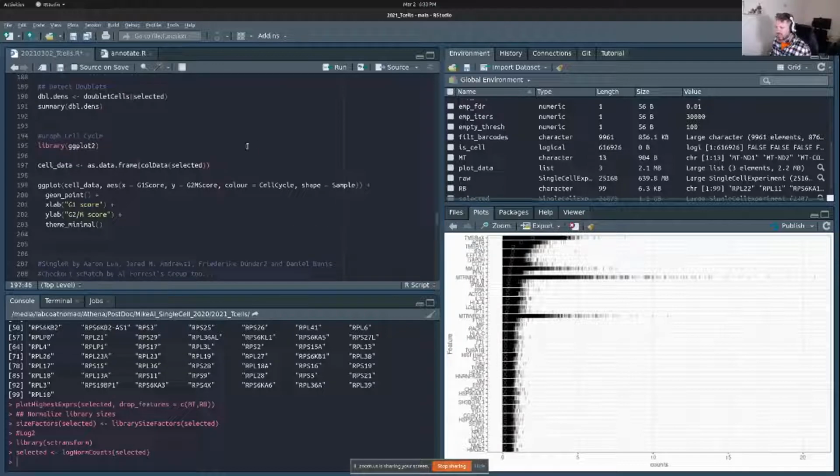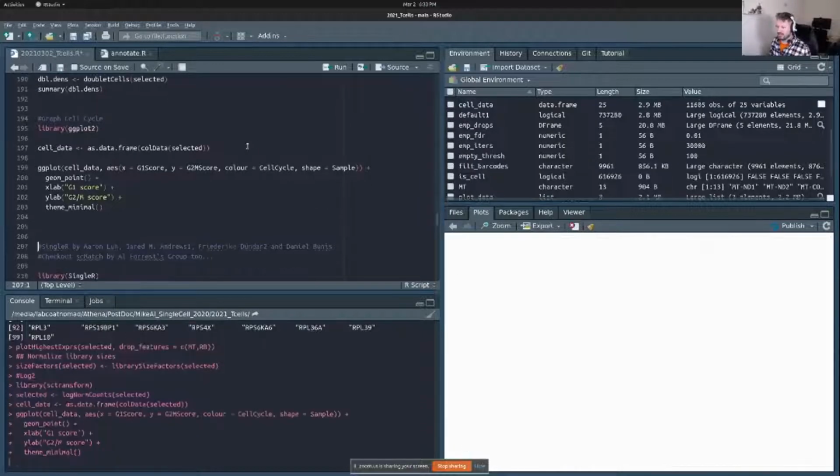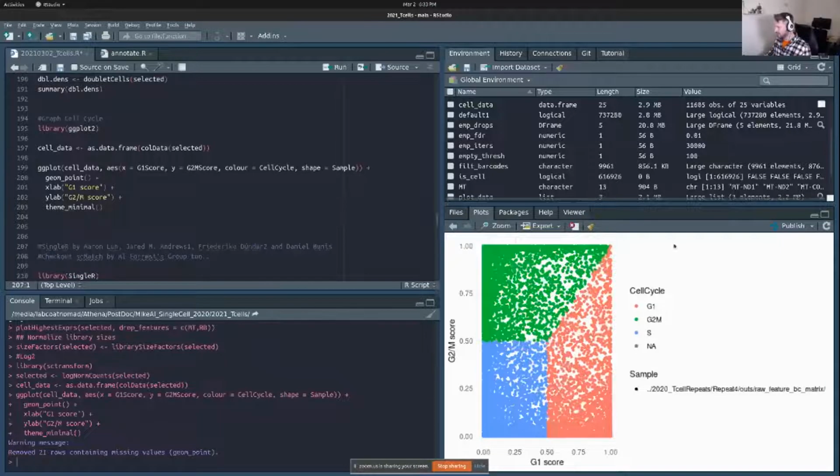One of the things you can also look at, obviously, is cell cycle. Again, I'm just using ggplot here. There's nothing really fancy. Oh, wow, this looks so weird zoomed in big. Anyway, as you can see, you might want to look at your cell cycle, see if there's anything crazy going on. Again, you might have an experiment where you're specifically activating a certain type of cell. Maybe you won't see an even proportion, but you know what you were expecting from your experiment. I'm expecting an equal number of cells in an equal phase. I don't expect them to be senescent. I don't expect them to be hyperactive. This is how I want them to look. If they didn't, this would be a red flag, right? It's part of QC.